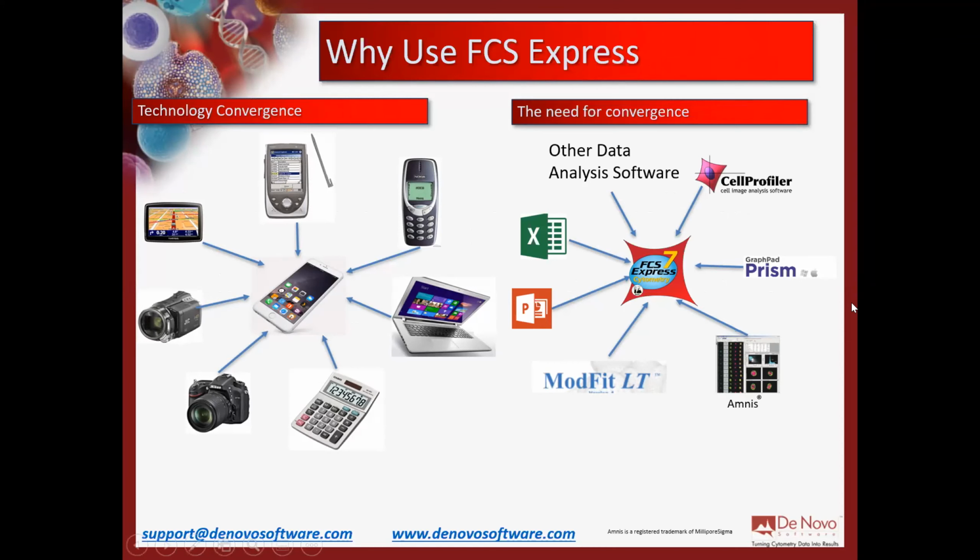So why use us? I always like to compare it to technology convergence, and I like to show these little pictures of devices that all do one thing. Without dating myself too much, this was the first cell phone that I had, this little Nokia. It made a phone call, you could send a $1 text message, and actually you could play a game of Snake, so maybe it did three things. But all of these things generally did one thing: GPSs, cameras, calculators, even computers.